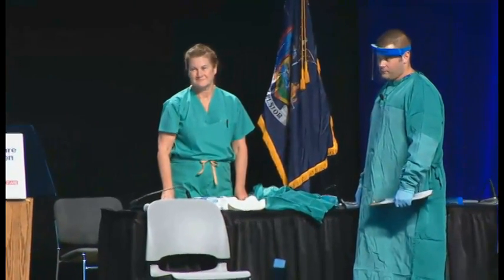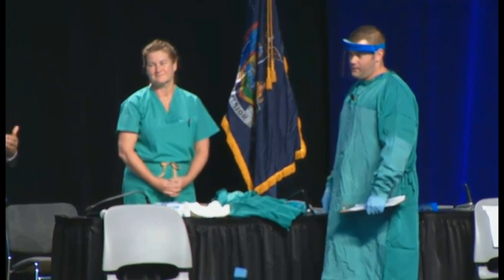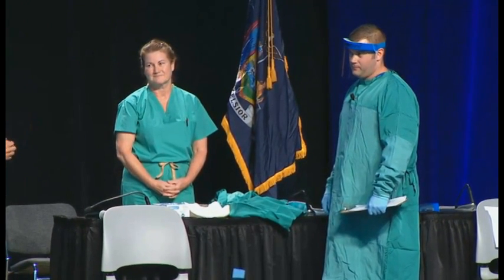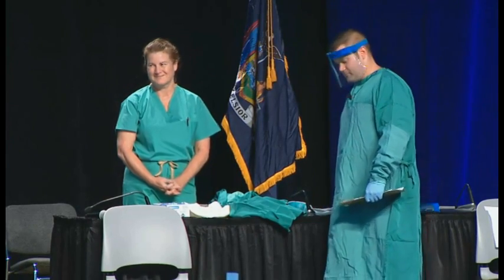They went through the list initially to see what they had. They've laid everything out, and now they're going to walk you through the steps for putting on the protective equipment. Let's give Brian and Barbara a hand for agreeing to do this for us.